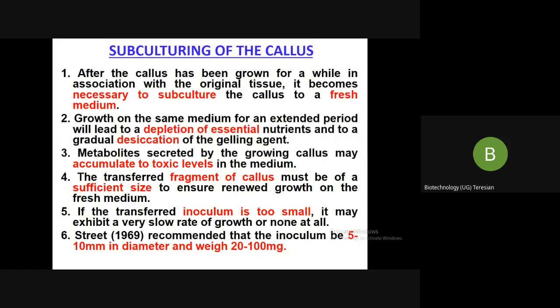I have an explant. From this explant, what did I develop? I developed a callus. Now, what you have to do? This callus is transferred into a fresh media. So how long should you transfer it to a fresh media? It takes approximately 3 to 6 weeks.